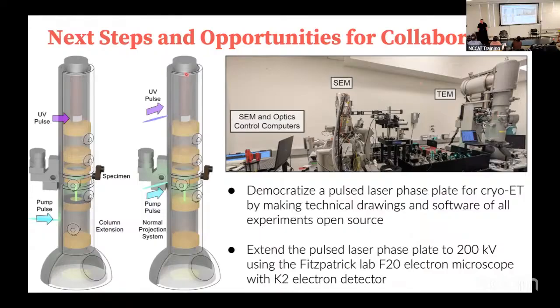And in that case, we will send the UV pulse into the tip here, and then we have two options. We can either send the green light in at what's called the octagon, which is around the stage, around where the sample actually sits, or we can try to put the green pulse down in the projection chamber, because it also crosses over there. You have a crossover there as well.